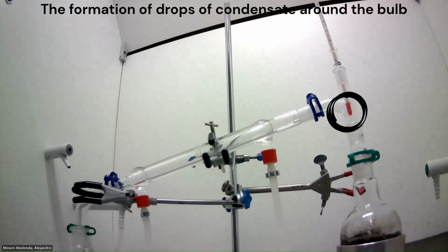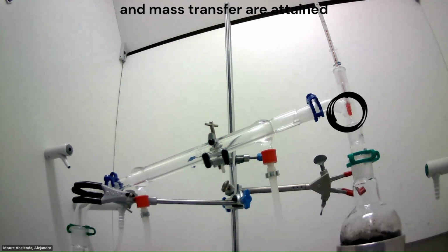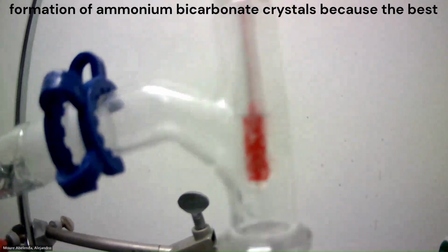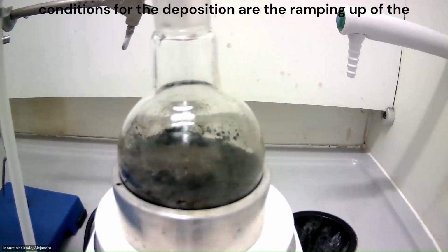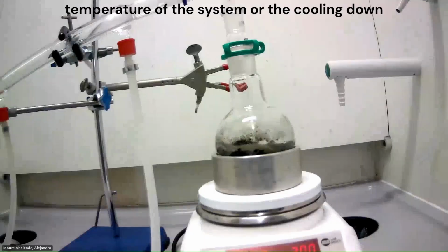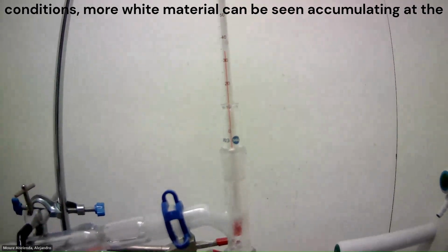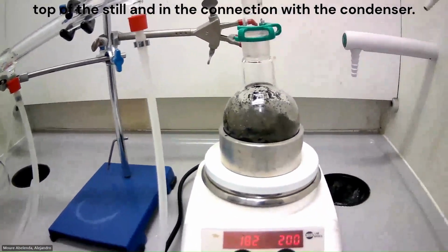The formation of drops of condensate around the bulb ensures that better conditions of chemical equilibrium and mass transfer are attained. Even at a temperature of around 30 degrees Celsius, it is possible to see more formation of ammonium bicarbonate crystals, because the best conditions for the deposition are the ramping up of the temperature of the system or the cooling down. After allowing 20 more minutes with these heating and stirring conditions, more white material can be seen accumulating at the top of the still and in the connection with the condenser.